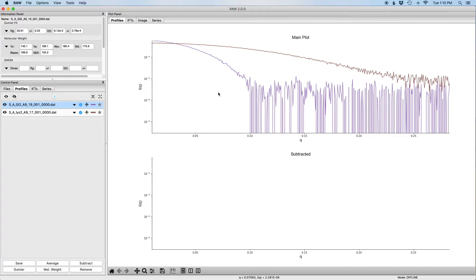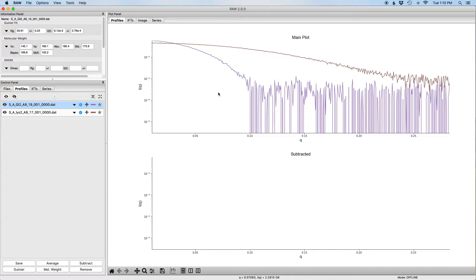Hello and welcome to this tutorial for BioLixtas RAW. In this tutorial you will learn how to use RAW to make Kratky and normalized Kratky plots.